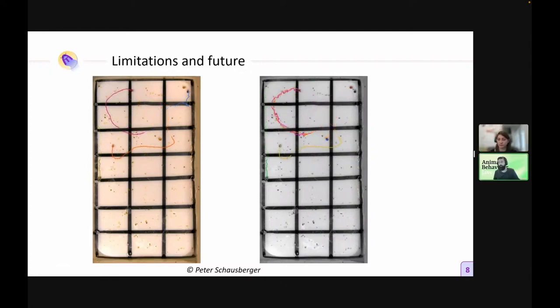Yeah, great. No, that's a cool feature. So we received a message from Jojo May, first saying thanks for the great presentation. The question arises as to whether you can track several body parts of an animal at the same time in one video. No, this is something for other programs, but AnimalTA is way too simple to do that.